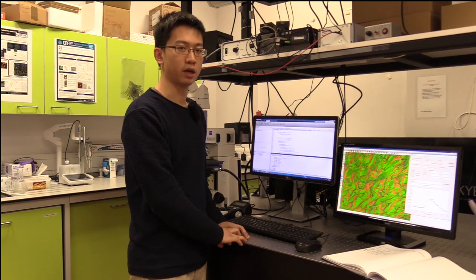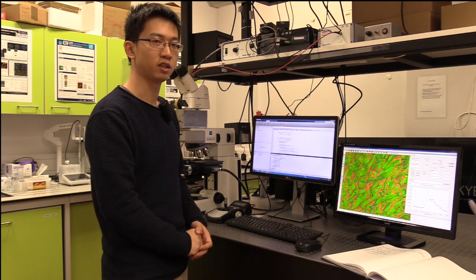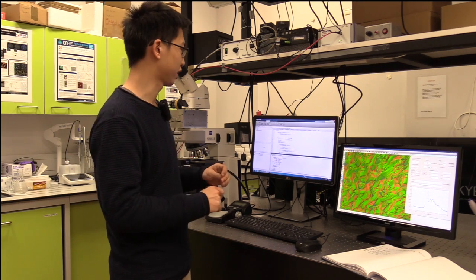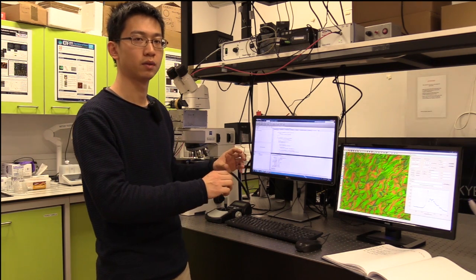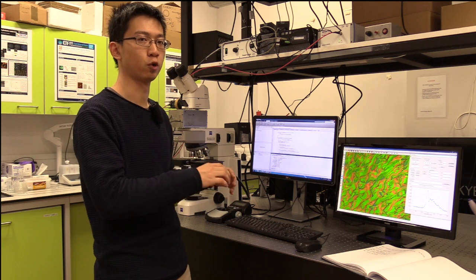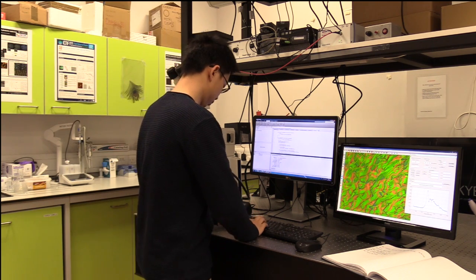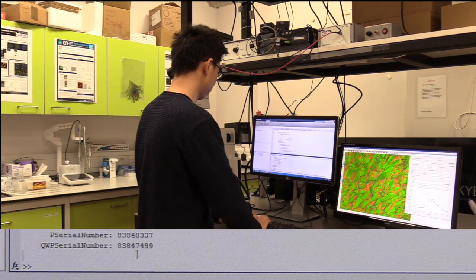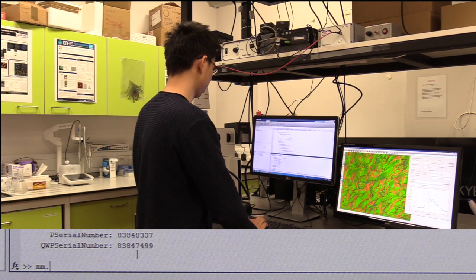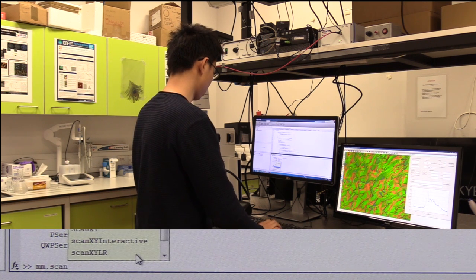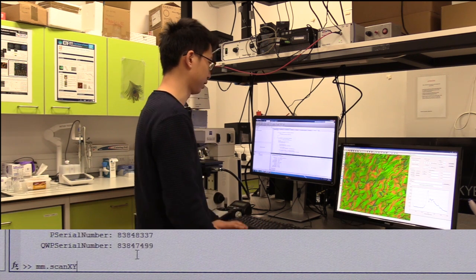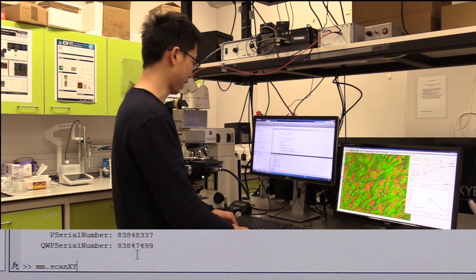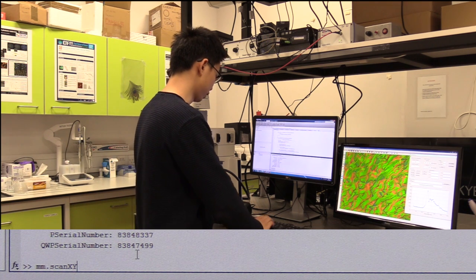A very common method you will use is scan XY. As the name suggests, it will let the stage scan in XY direction and take measurements for each point scanned. To do that, I type in mm dot scan XY, and then I type in the range and separation for points. For example, I want to scan from 0 to 1000 with 100 micron in between each point.